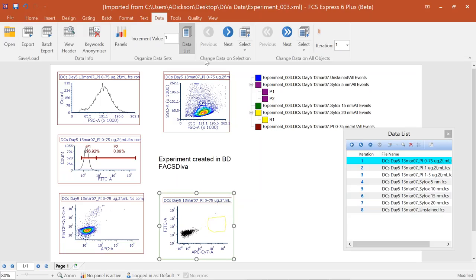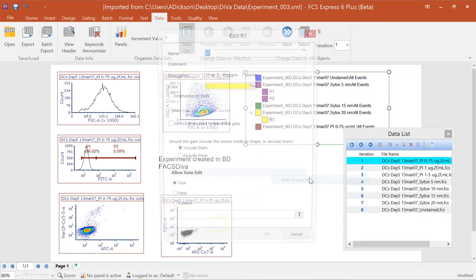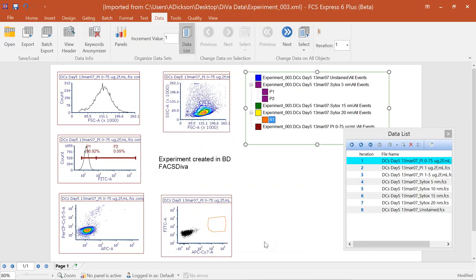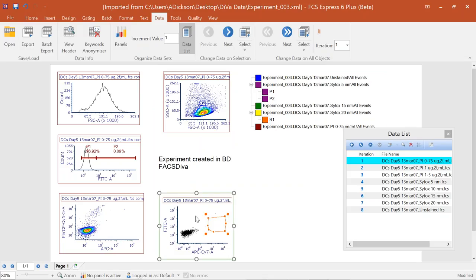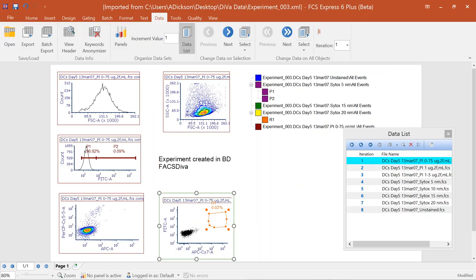We can use this imported workspace as a starting point and create or edit gates however we want. For example, if I don't want a gate to be yellow, I can right-click on the R1 gate, go to Gate Properties, and change the color. All the normal workflows available in FCS Express layouts work with these imported acquisition templates. So now this gate is orange, and I can add that to a text box as well.